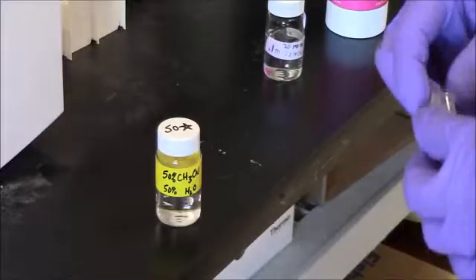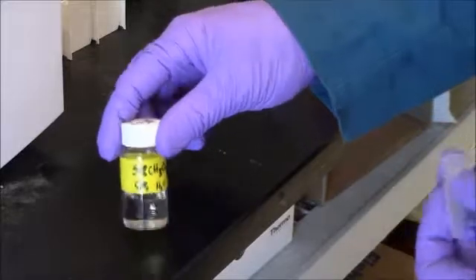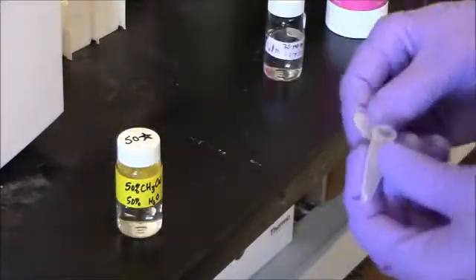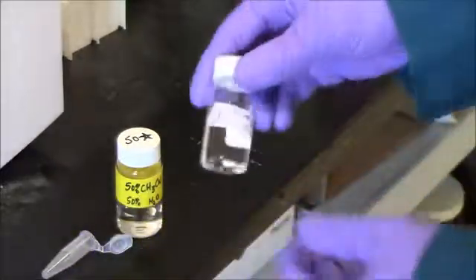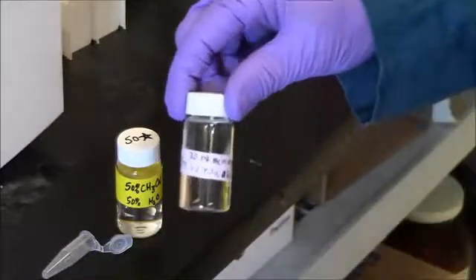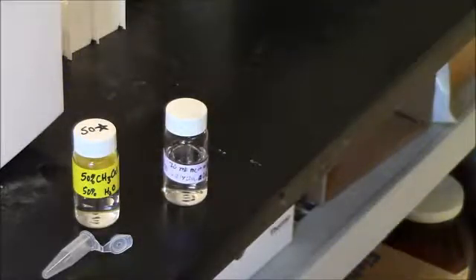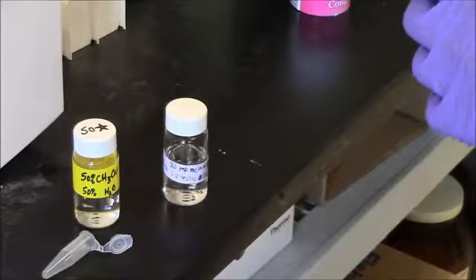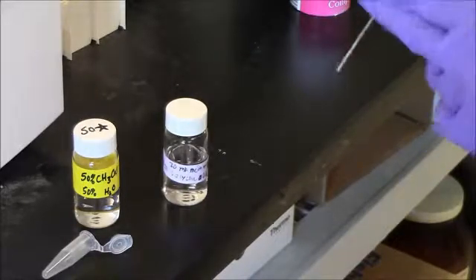For the esters, the recommended diluent will be 50 star, 50% water, 50% acetonitrile. And I'll make the dilution in an Eppendorf tube. I have here a stock solution of 0.1 molar salicylic acid. To make the dilution, I'll do a 50-fold dilution, which will make the concentration in the Eppendorf tube 2 millimolar.